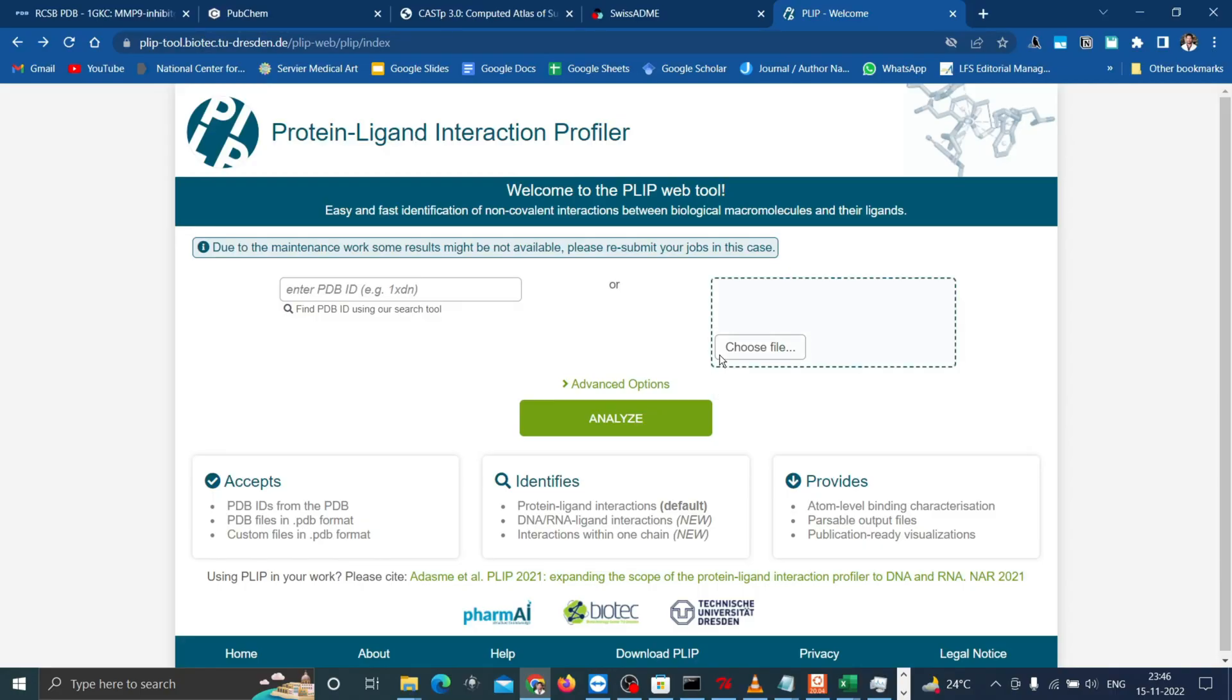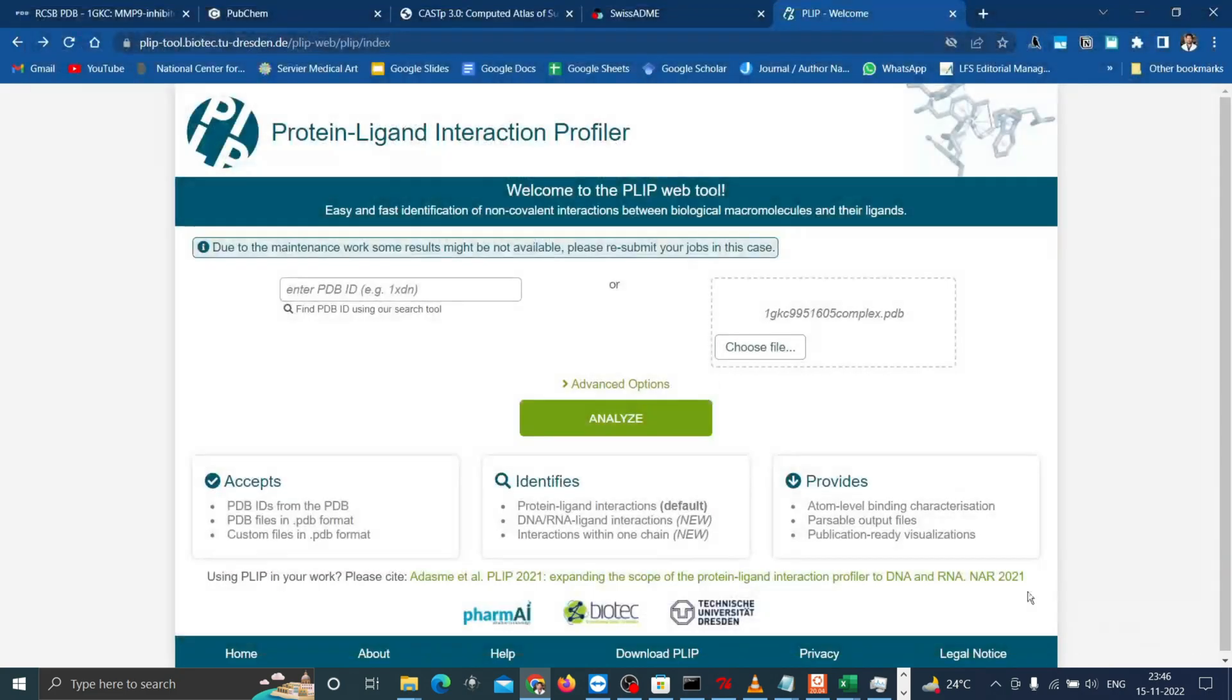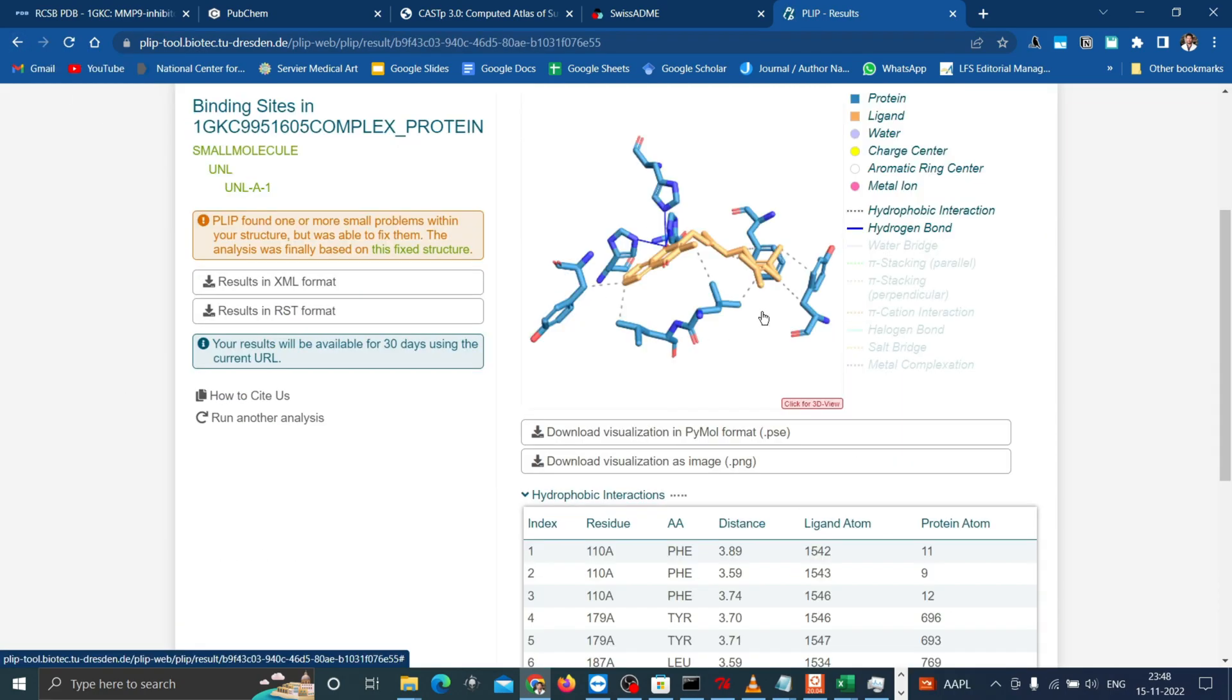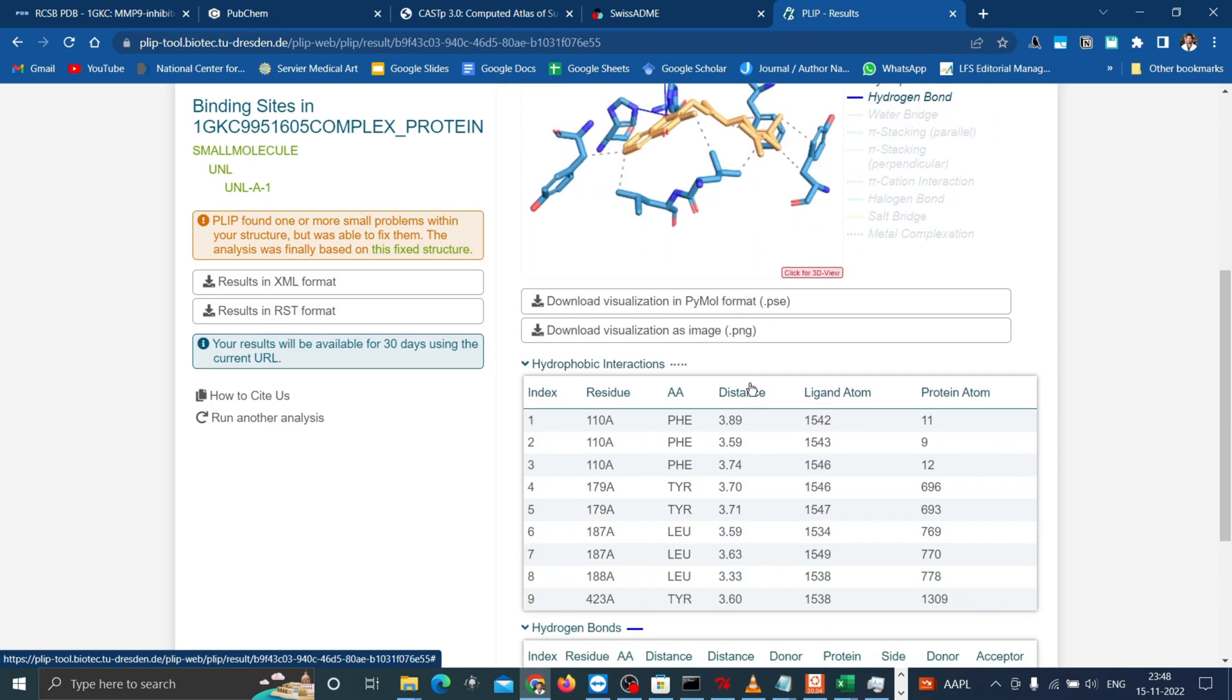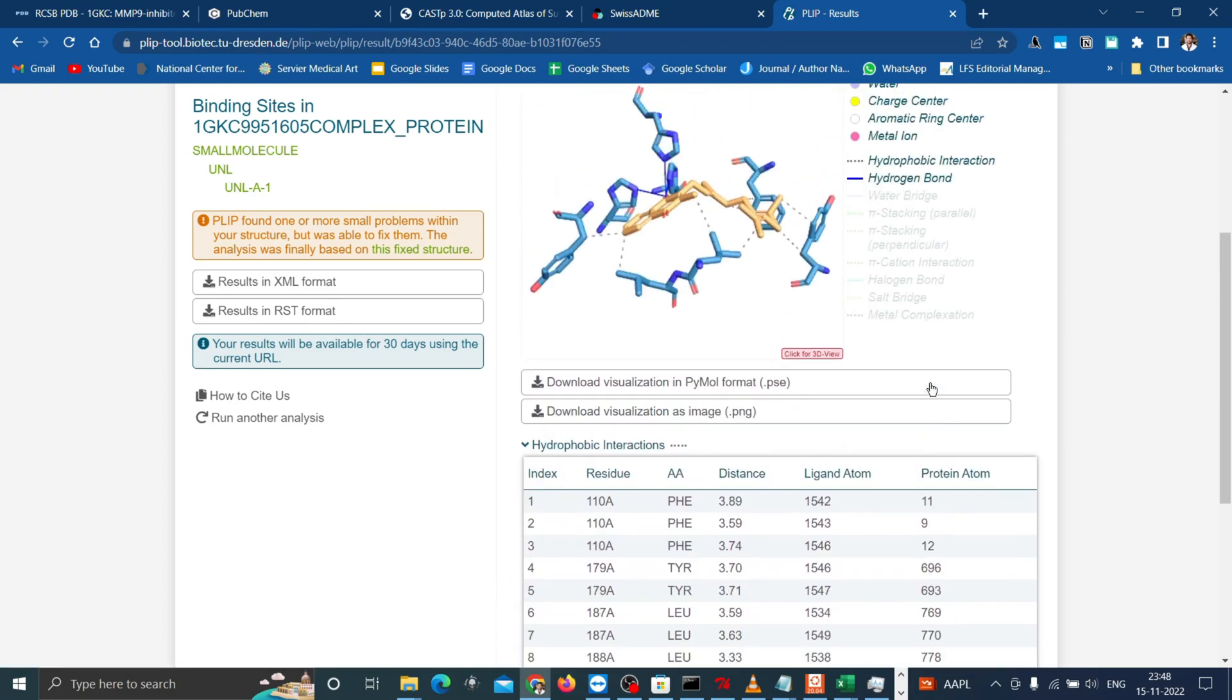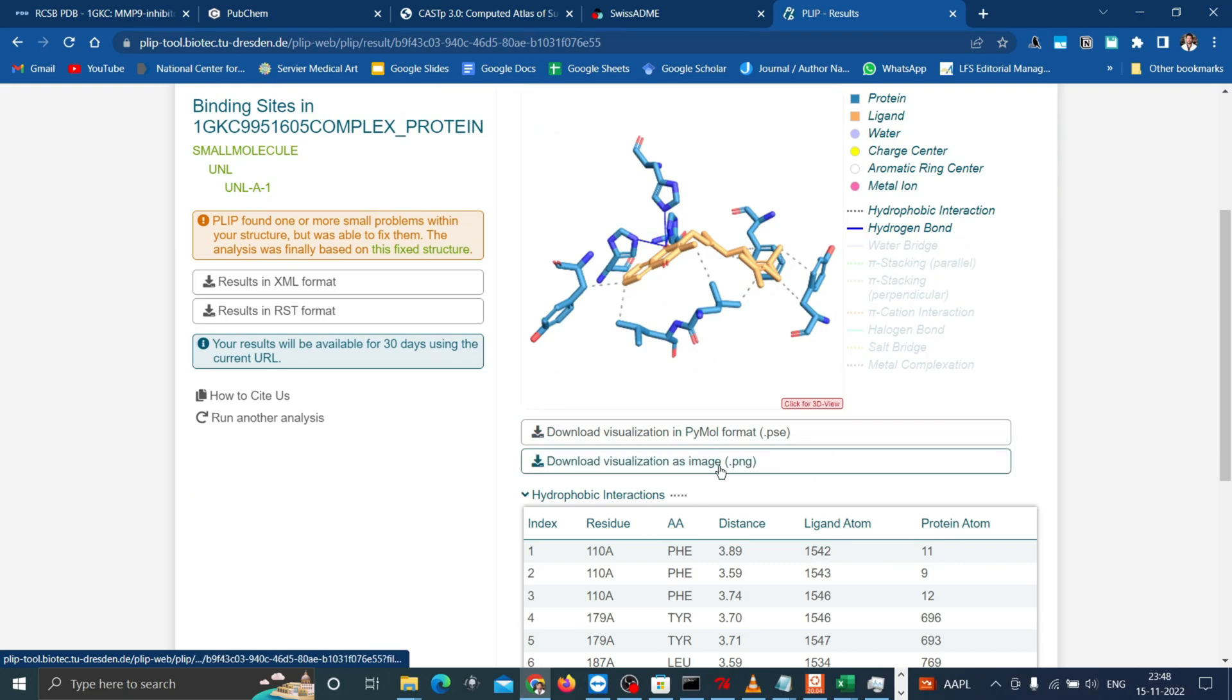Now switch back to the browser and go to the PLIP website. Click on choose file and open the complex in PDB. Then click on analyze. It takes a few seconds to analyze and get the results. As you can see this is the docked image with the list of interactions. PLIP also gives the detailed hydrophobic interactions and hydrogen bonds in the results section. You can download the visualization as image or PyMOL format.